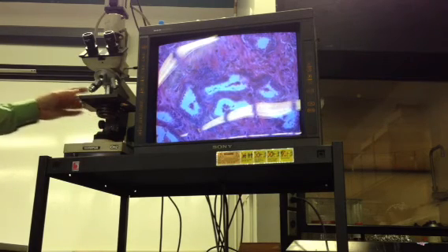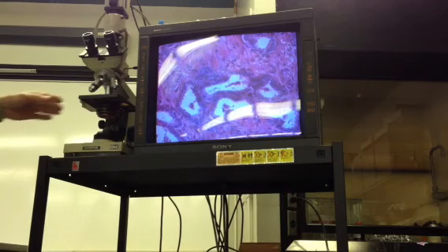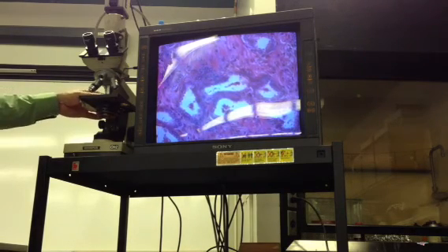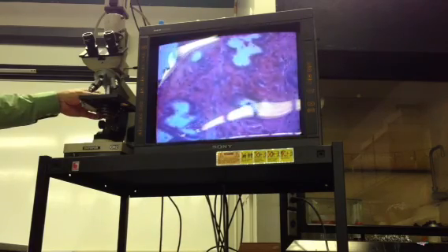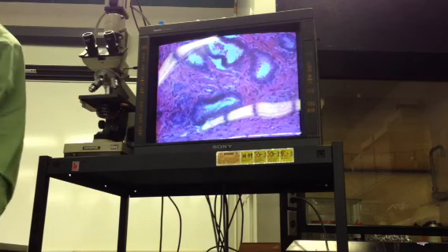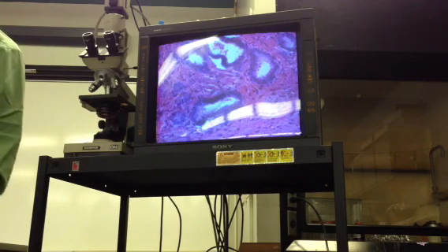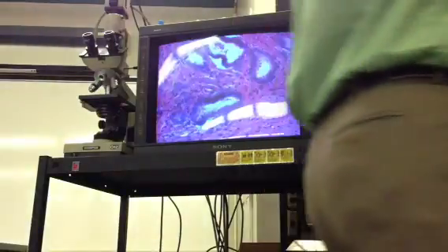Okay. Oh, I have to give you all back your lab reports too. None of that's stromal tissue. Stromal tissue? That's all stromal, both in this one and in the seminal vesicle. No. Seminal vesicle has very, very little stromal tissue. Oh, well, okay. That's the difference there.